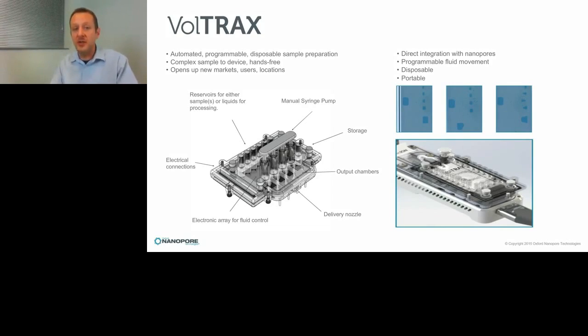Ultimately, we'll be tuning the device so that it's capable of extracting the DNA or RNA from a range of samples, as well as performing the library preparation at the user's choice. So the user just has to add a bit of sample in liquid form and then sit back and wait, and the sequencer will take care of itself. But anyway, back onto species identification.